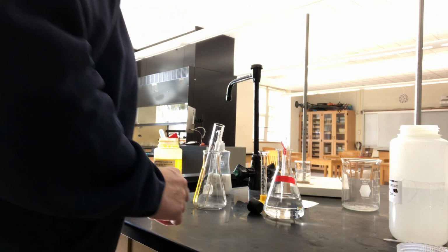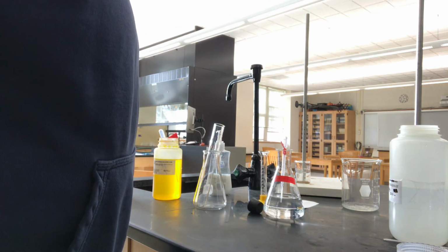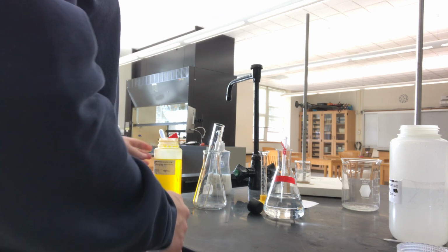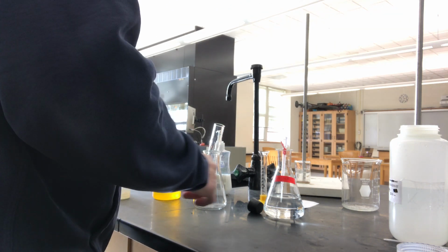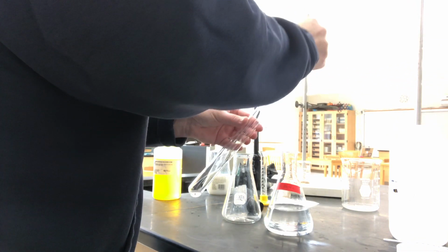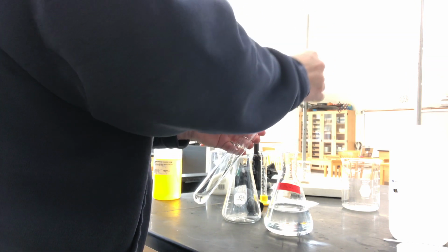Okay, and the second part, close that up. The second part, it's about barium chromate. So we're going to start with some barium chloride. I have it right here in front of me. So we're going to put a little bit of barium chloride in the bottom of this test tube. We're using big test tubes just to make it easier to mix. Doesn't really matter how much I use. Okay, and then a few drops of the sodium chromate.